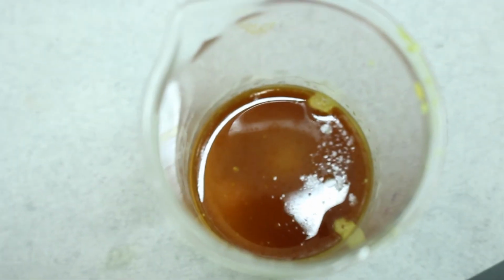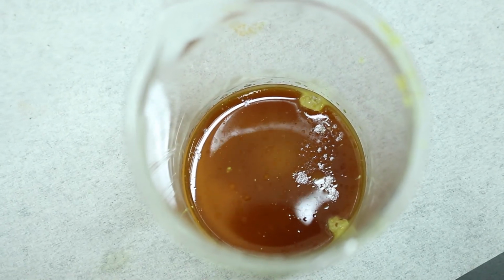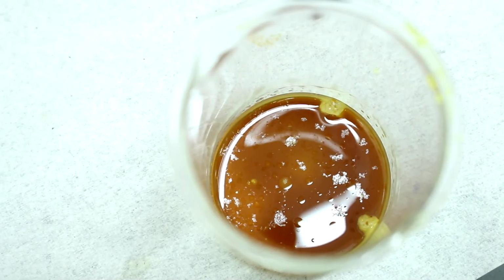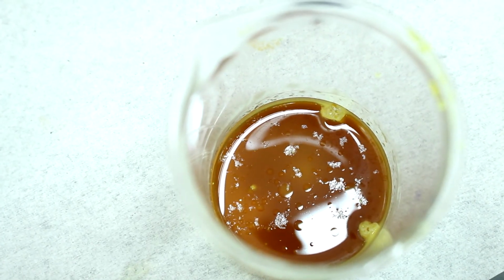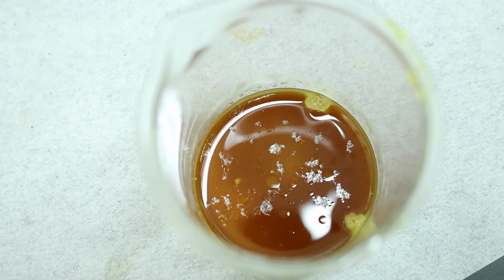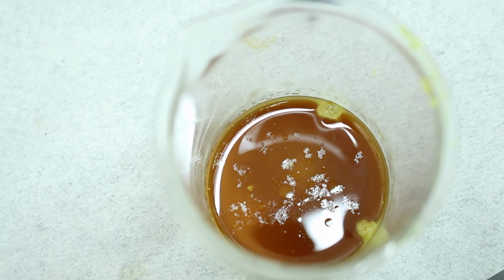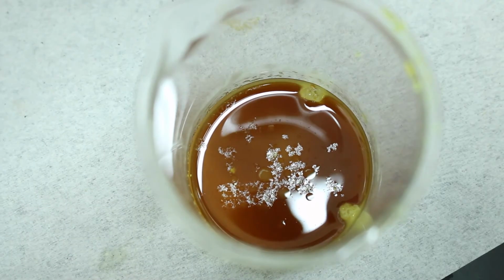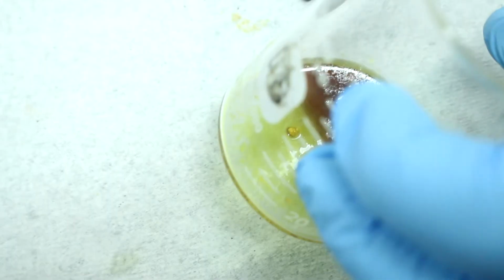I think it's super saturated. See, something oiled out. That might be it, actually. The product might just melt. Yeah, but that's more akin to an oil. It's not really.